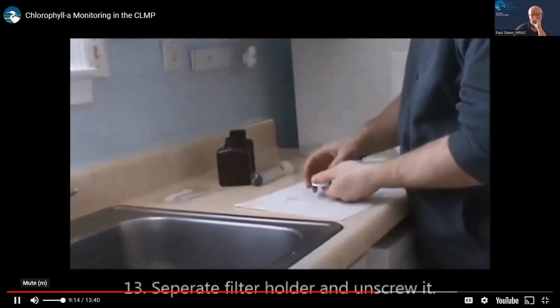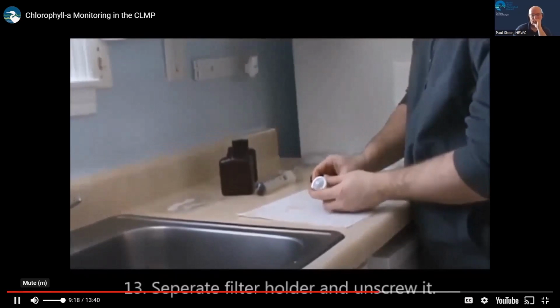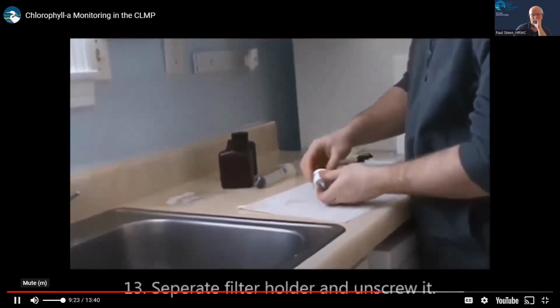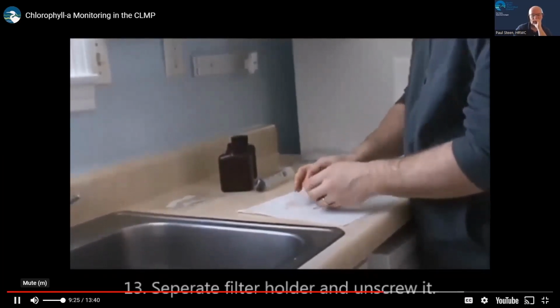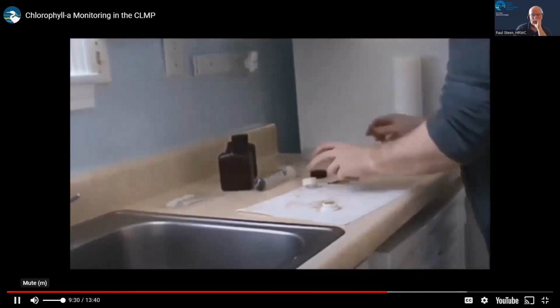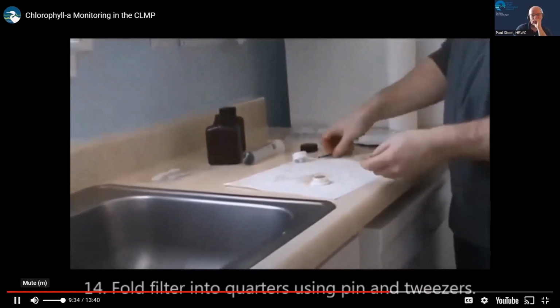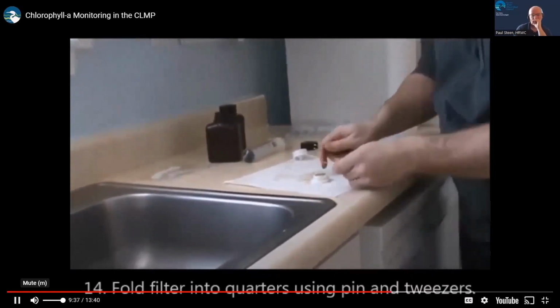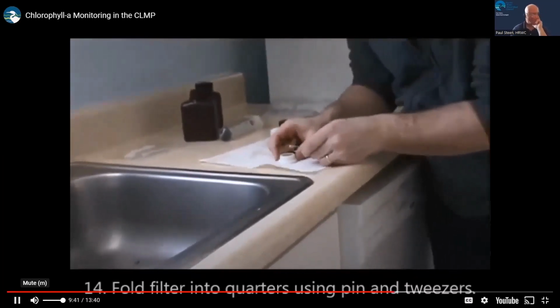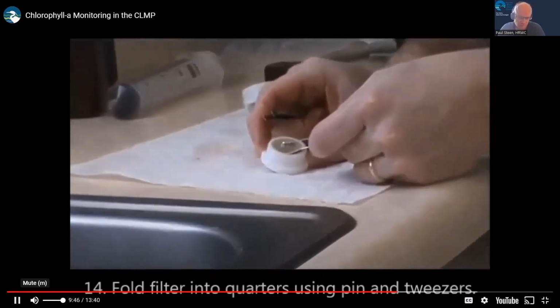After filtering the water, separate the filter holder from the syringe and unscrew it. Using a safety pin and tweezers, fold the filter in quarters with the algae on the inside. The filter will probably stick a bit to the filter holder, and it requires a steady hand and some practice to do this job smoothly.